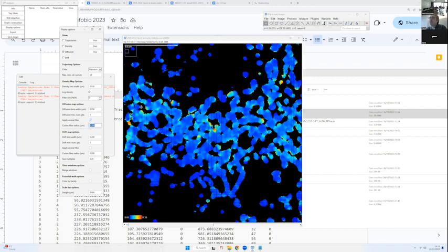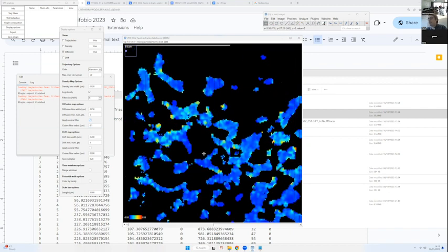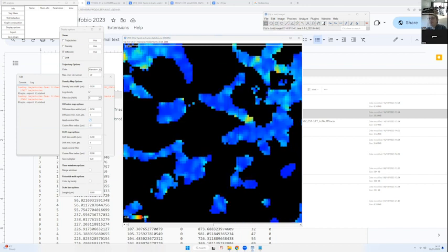And you see that now we have these weird sausages that appear, and these weird sausages are controlled by this cosine filter radius. If I reduce the radius, I will reduce the size of these sausages. What matters here is that for this method to make sense, you need your radius to be larger than your bin width. If the size of your bins is larger than the size of your filter radius, it doesn't work.